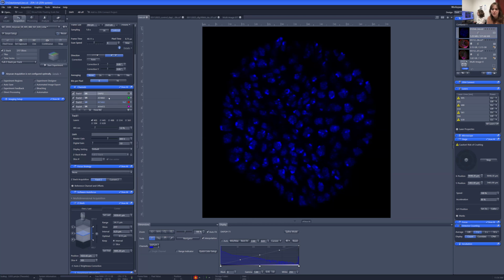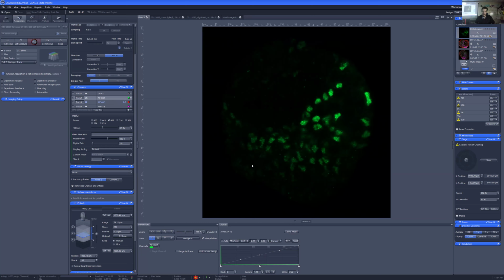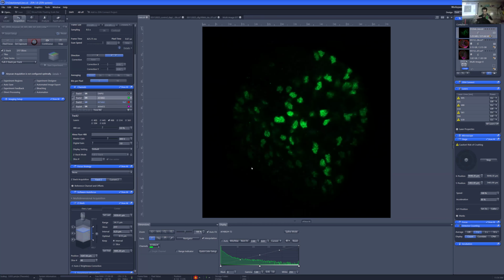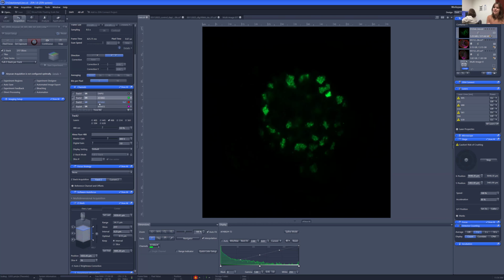While you're setting things up, do people have any questions in the class? You said this microscope uses lasers, and those lasers are to shine on those fluorescent tags, and that's how it pops up on the screen. That's correct. Yeah, you got it.